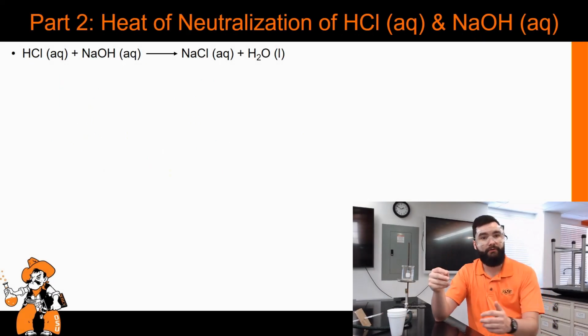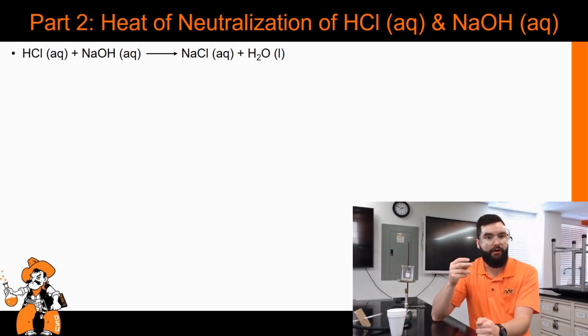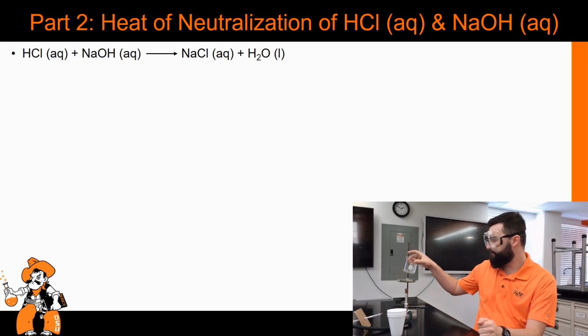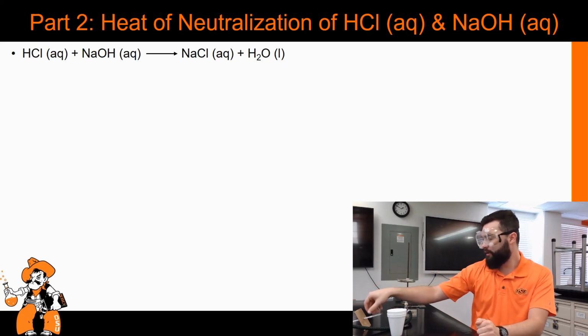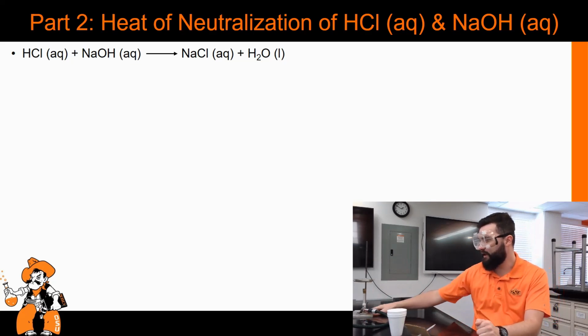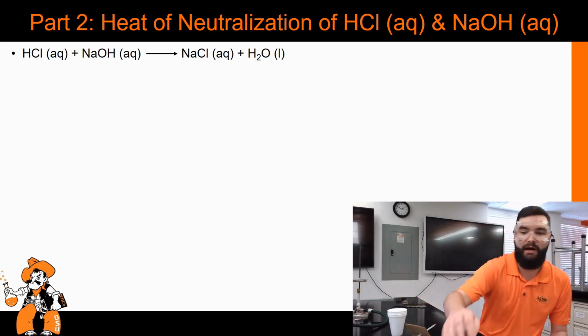So now, moving on to part 2, here we are mixing aqueous hydrochloric acid with aqueous sodium hydroxide. I'm going to go ahead and measure out my aqueous sodium hydroxide and hydrochloric acid.